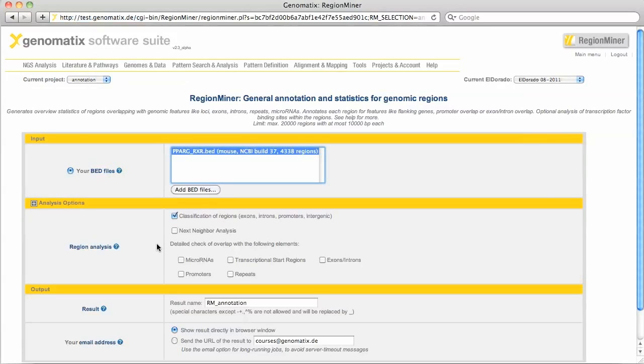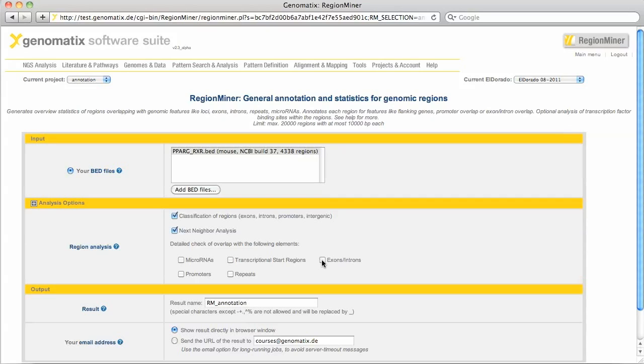For the detailed analysis we need to activate the next neighbor analysis option. In addition I will check the exon intron overlap and the promoter overlap. In this way I can afterwards easily get the genes whose promoters or loci overlap with binding regions.